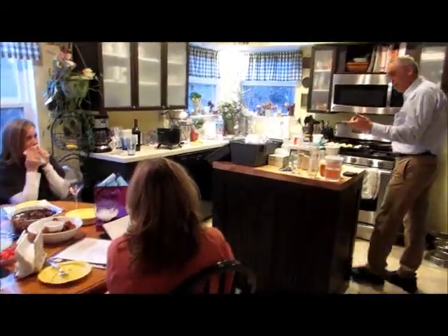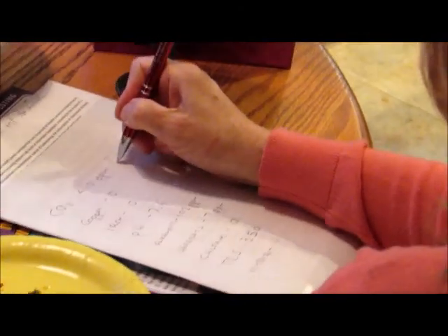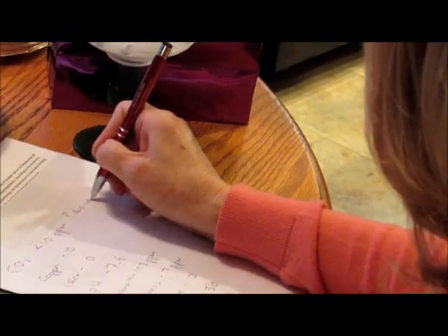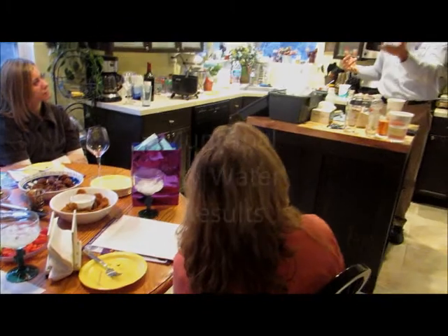We tested carbon dioxide, which is a dissolved gas in the water, and that was less than 10. But again, because this sample had a lot of air in it, it might not be completely accurate. So as a backup, I tested for copper, because if the carbon dioxide was in the water, it would be corrosive to the copper pipes, and then we get a copper reading no matter what. But I didn't get a copper reading.